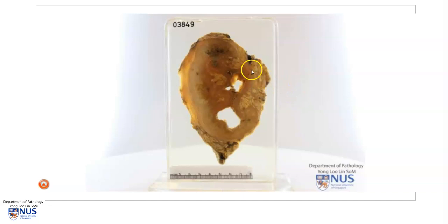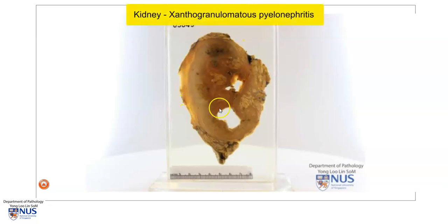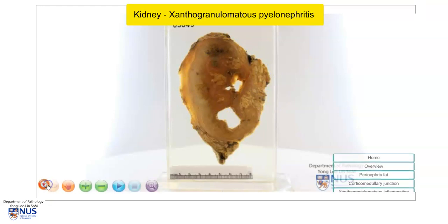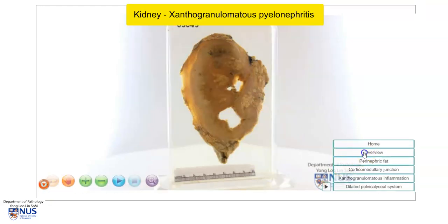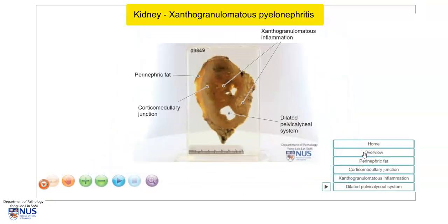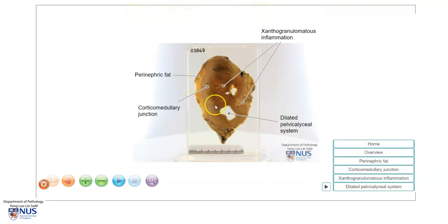Hello, this is a virtual pathology specimen of a slice of the kidney from a case of xanthogranulomatous pyelonephritis. Let's orientate ourselves. Here we have the perinephric fat, this is the cortex of the kidney, and this is the area of the medulla with the renal pelvis.